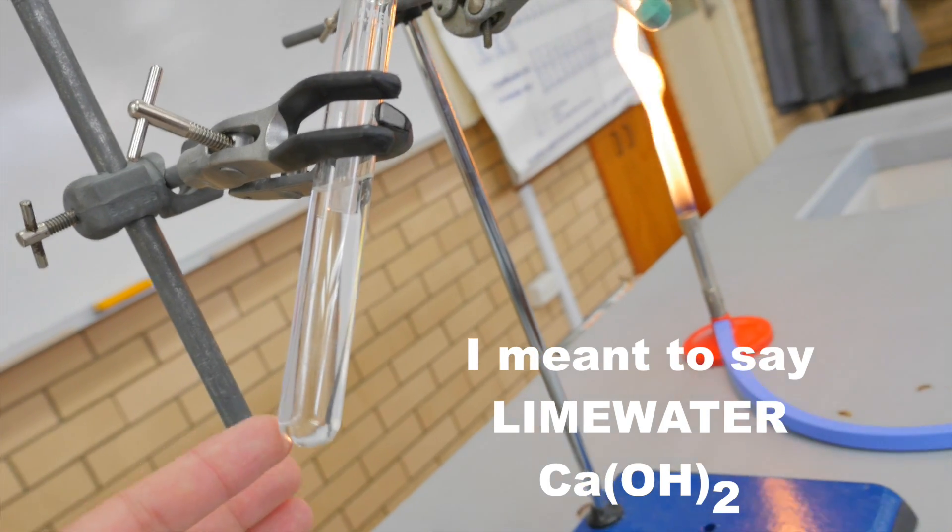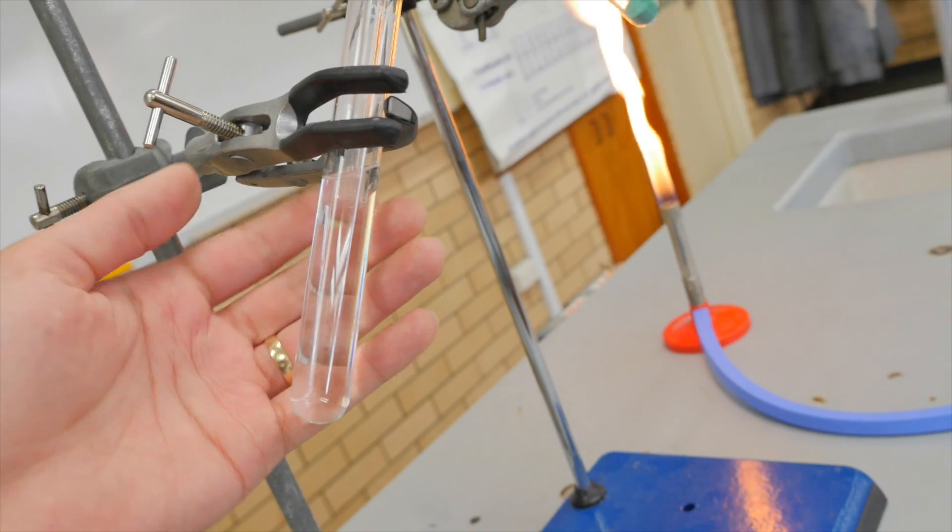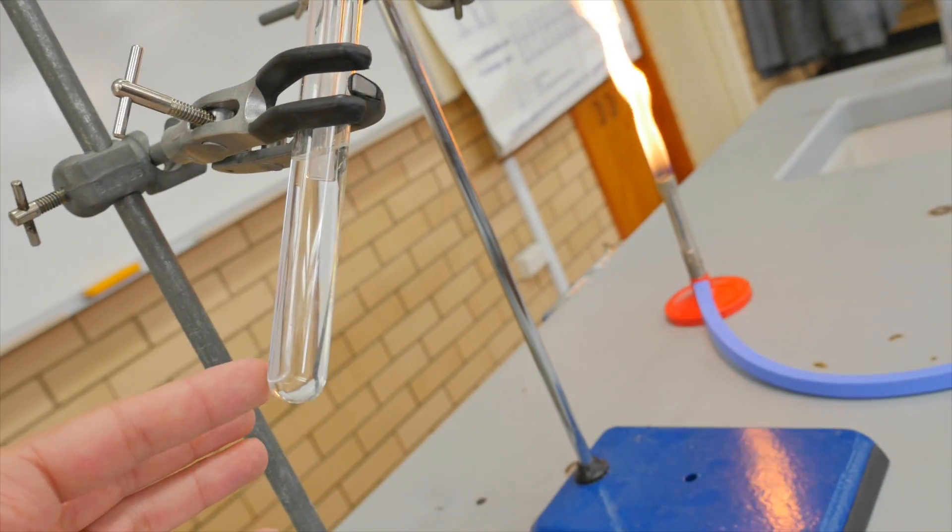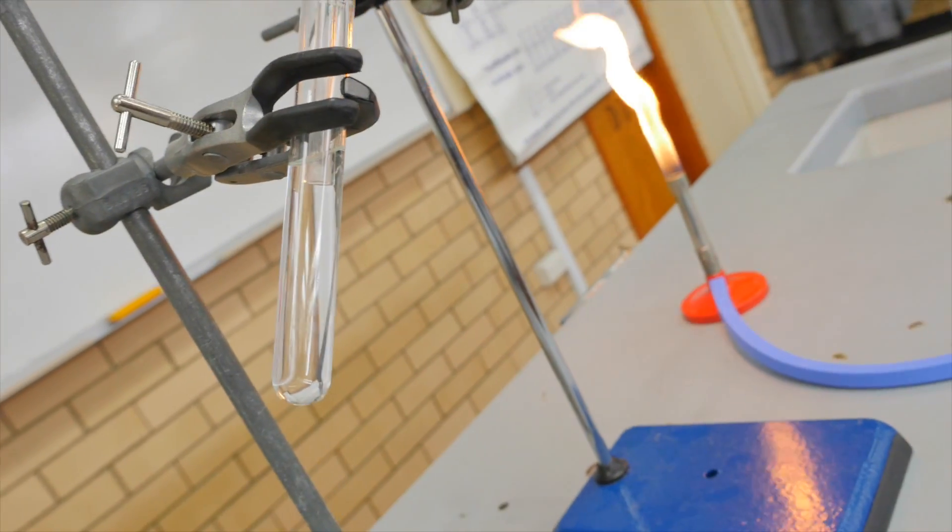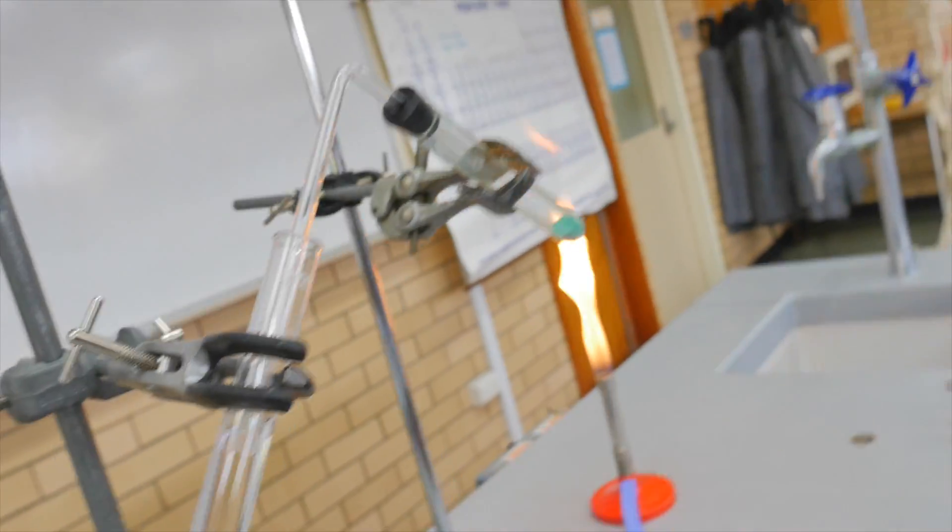Lime water reacts with carbon dioxide and it makes it precipitate. So, if we see this change into a cloudy color, we know it must be carbon dioxide. If not, it might just be the oxygen or something like that. So, let's put it down here in the tripod and see what happens.